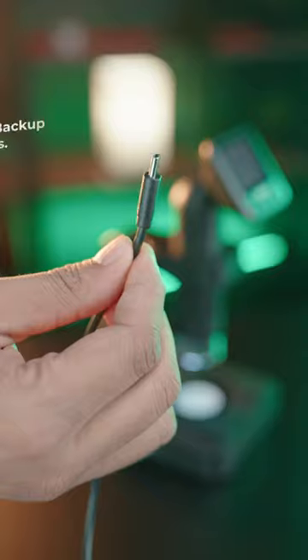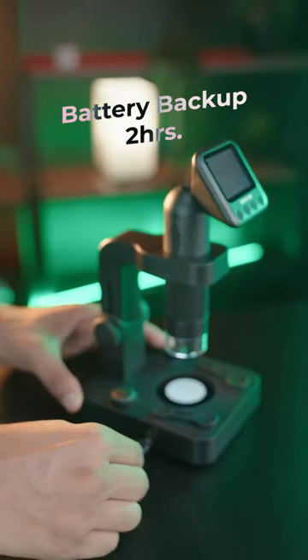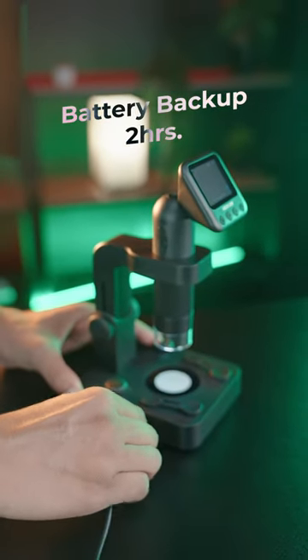It has a durable body. With a single charge, it can accompany you for up to 2 hours, and it is charged by Type-C.